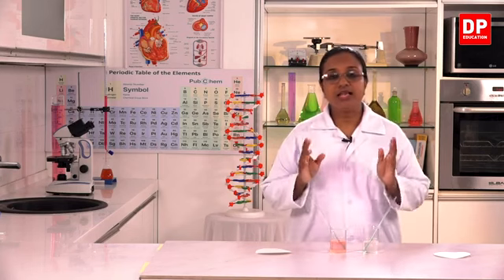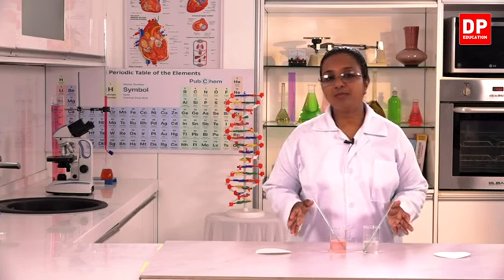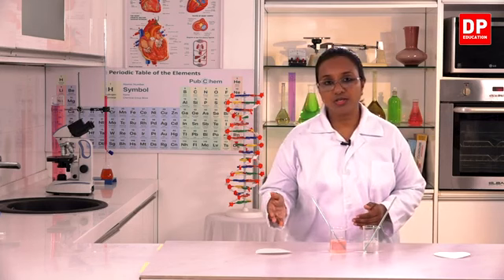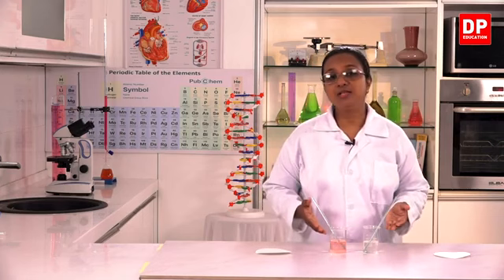So here we had the same solute under the same temperature, but the solvents are different. Water can dissolve sugar well, whereas kerosene cannot dissolve sugar. So that means the solubility of a substance depends on the nature of the solvent. Okay students, now we are going to demonstrate how pressure affects the solubility of gases, or check and see whether pressure affects solubility of gases.